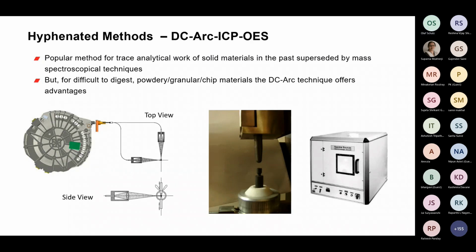a mass spectrometer. The DC-arc is a separate unit which is connected to the optical emission spectrometer, and when operated in conjunction with an ICP-OES, there's no plasma operation during the analysis, but an optical fiber is plugged into the instrument's radial interface. For the analysis, sample material is weighed into a hollow graphite electrode and is placed into the DC-arc unit. A direct current arc produced between the sample and the counter electrode vaporizes the sample material over time according to its volatility, and at the same time atoms are excited to the emission of radiation, which is transferred to the optical system by the optical fiber.